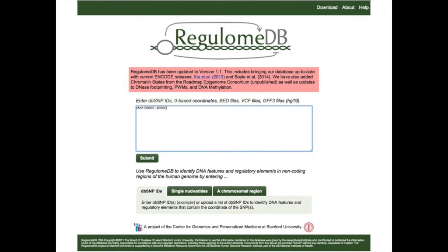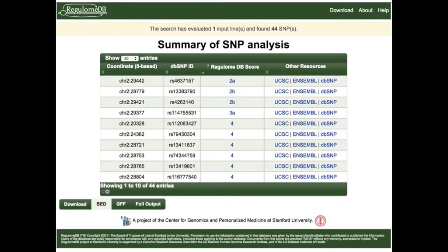If you go to the RegulomDB website, you can enter your data in a variety of ways: enter your SNP IDs directly, enter a range you're interested in, or upload BED files and VCF files if you have many SNPs to investigate. In this case, I chose a region on chromosome 2 from 20,000 to 30,000. When you click submit, your results are presented showing 44 SNPs in that region, ranked from highest to lowest significance score.